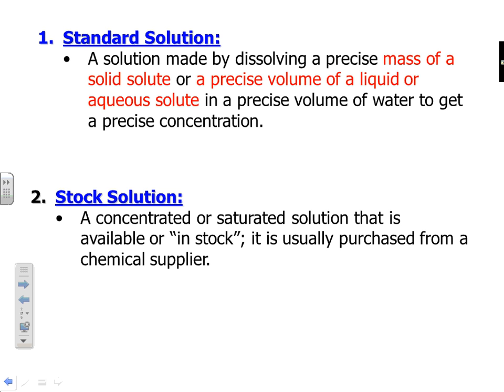Now, I guess you might ask, why don't we use a scale like that here? Well, the reason we let the grade 9s and 10s use the first type of scale is because they're about 150 bucks, right? They're just a general scale that is quite reasonable. These scales that we use are about $400 to $500. All right, so we don't want the grade 9s and 10s sticking stuff on it, measuring their thumb and all that other crazy stuff that they will do. So we don't let them use it.